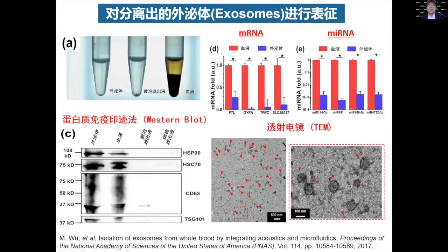So we also characterize exosomes. We look at the protein expression. We look at mRNA, miRNA, and also the morphology. They all look very nice.